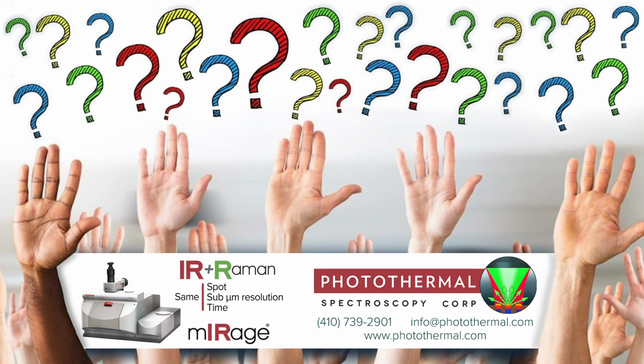Yes. All right, thank you. But I think for me, I'm excited at the prospect of now not having to culture bacteria. So I think that the potential now exists to be able to filter bacteria directly out of various bodily fluids or other fluids, and to be able to measure the cells directly. I think it sounds like it'll be a great saving in time. Let's move on to the next one.